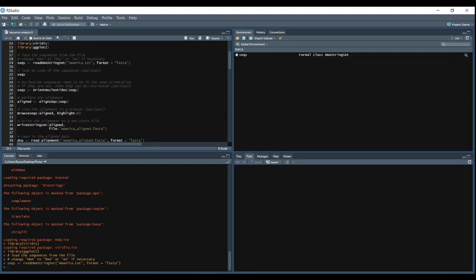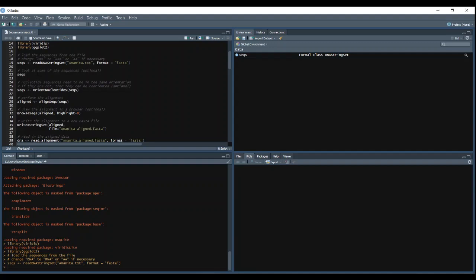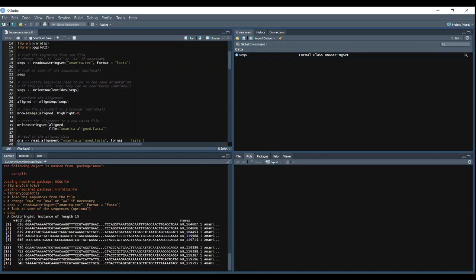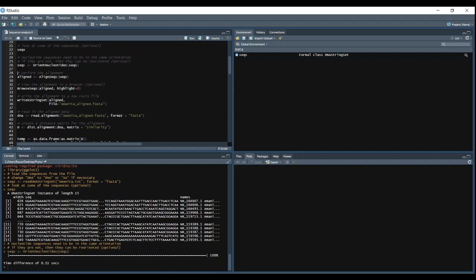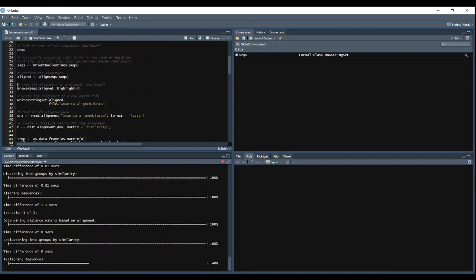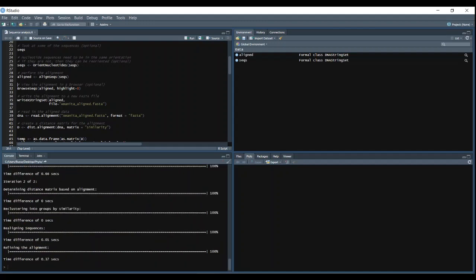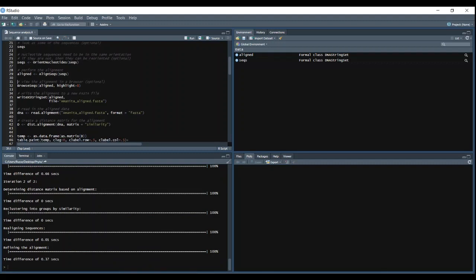If you use a function, for example, like readFASTA or one of the other various functions that reads in FASTA files, our FASTA data is not aligned yet. So we have to first align that so we can use it in tree building and things like that. We look at our sequences. They all have different lengths. So we're going to reorient them. And then we're going to use the alignSeqs by the seqinR package to align our sequences. And what this does is it aligns the similarities between the sequences and then it cuts the length. So it trims them all to the same length.